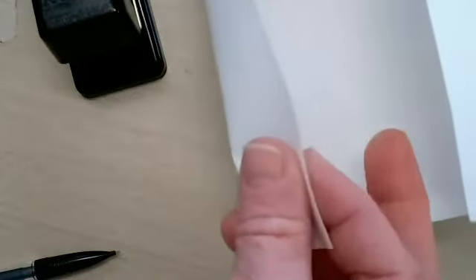So then I'd like us to keep the staplers up here. Then you come to the stapler, because if we take things back to our station, sometimes they just get lost. So you just create a cylinder, but we don't want to overlap the chromatography paper. So what you'll do, and I will be an extra set of hands for you, we will staple it such that it is not overlapping, but yet held as a cylinder.